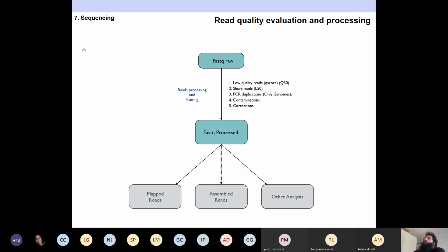So once you receive the reads from the sequencer, depending on the methodology, you receive FASTQ files or maybe BAM files. No, PacBio is producing BAM files. Even if they have not been mapped into anything, they like to store sequence as BAM. But the most common thing is FASTQ files.